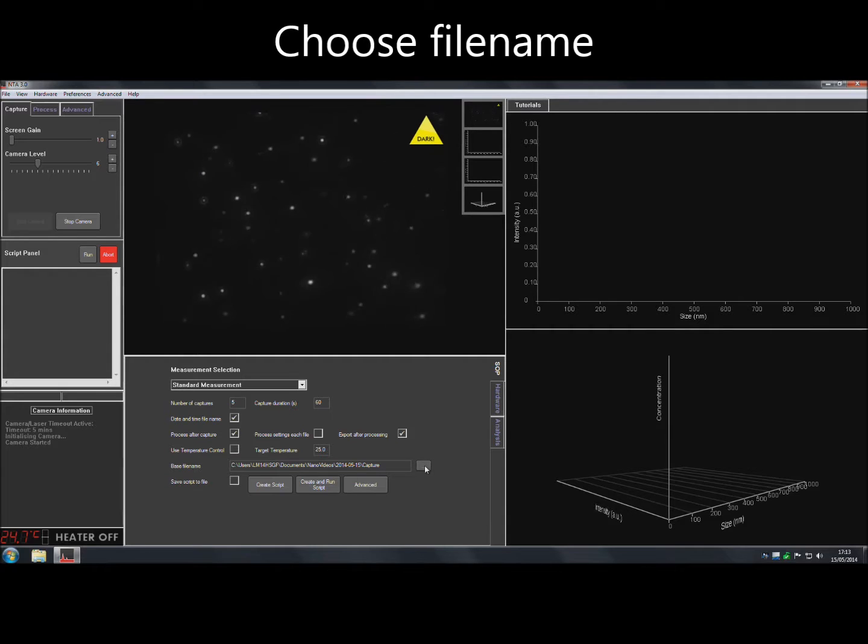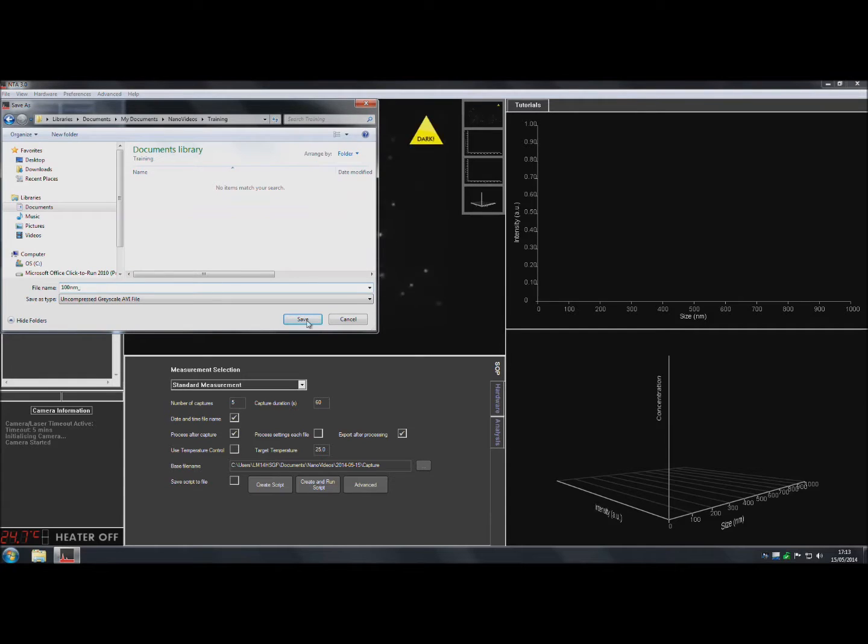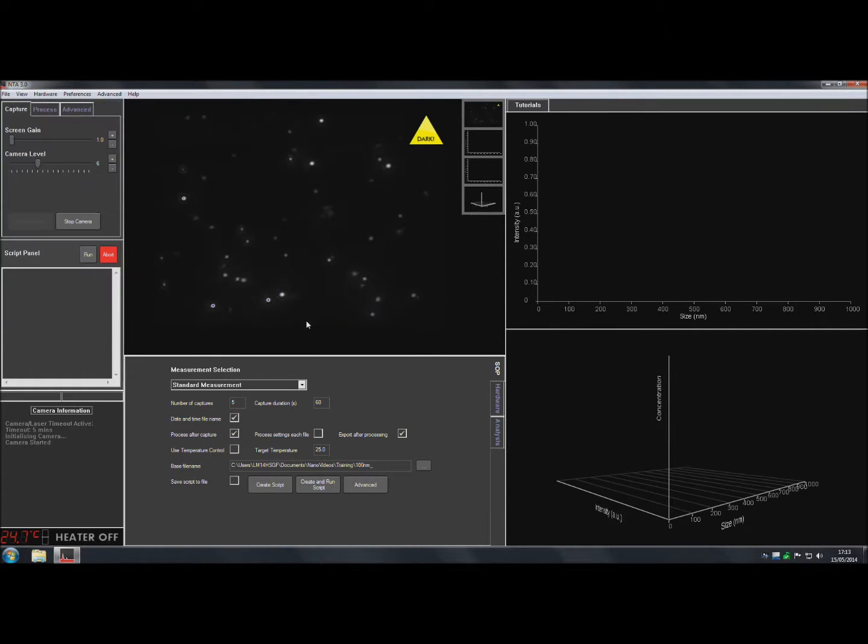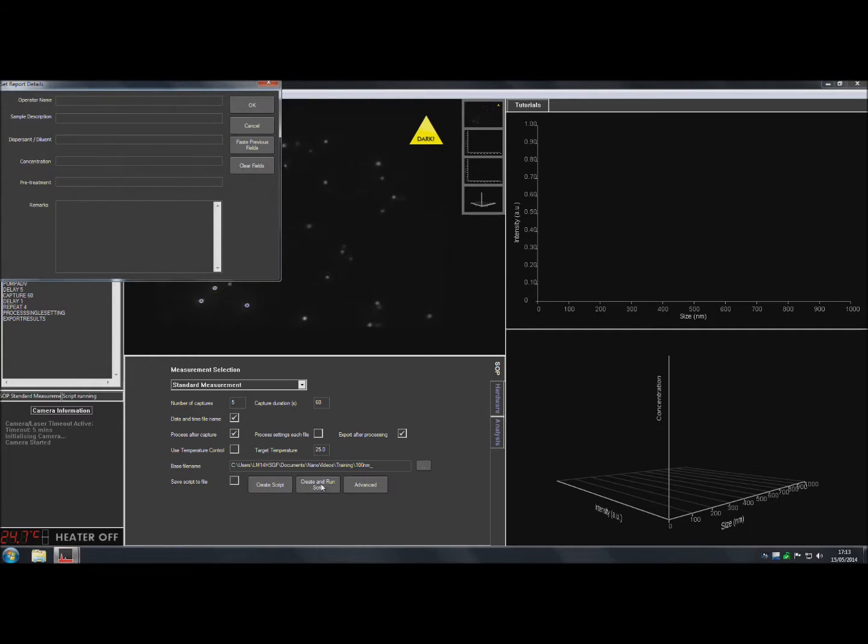Choose a name and location for the captured video files. When ready, click Create and Run Script.